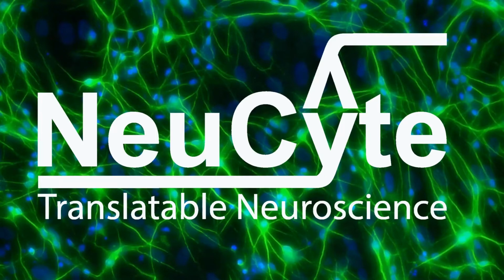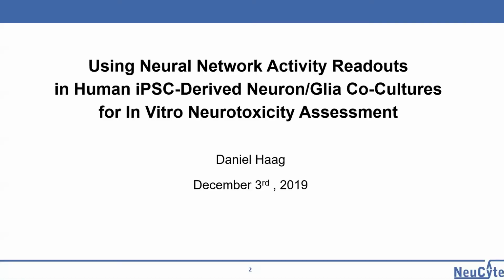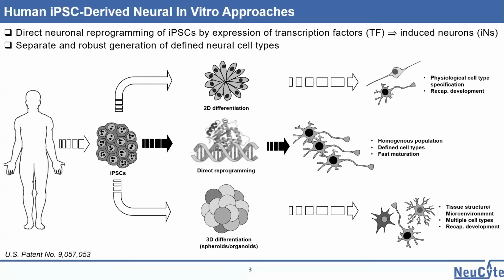Thanks everybody for joining in. I would like today to give you some background on our technology for making neurons from human pluripotent stem cells, and particularly on the characterization of these cells, and show you some application examples for neurotoxicity testing and CNS liability assessment.